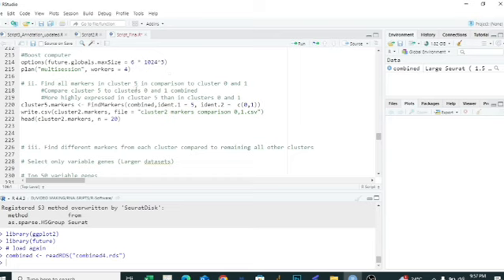we use the FindMarkers function from Seurat, and to find the markers of cluster number 5, when we run this function, it gives those markers highly specifically expressed in cluster 5 in comparison to cluster 0 and cluster 1. So this function can be used when we have a doubt between some clusters and the markers of those clusters may be related or similar.